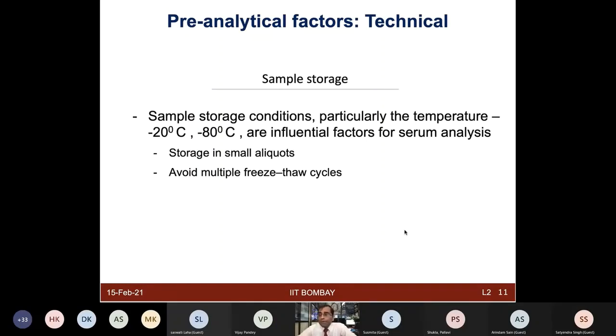Again, just for practical experience, what we try to do for any project when we start a clinical project is buy the reagents in bulk. We also buy the plasticware in bulk and try to provide our clinical collaborators the same reagents, so that at least that much variability can be reduced. We also try to optimize the conditions in our lab here and first mimic that in the collaborating hospitals, and only then are the samples collected.